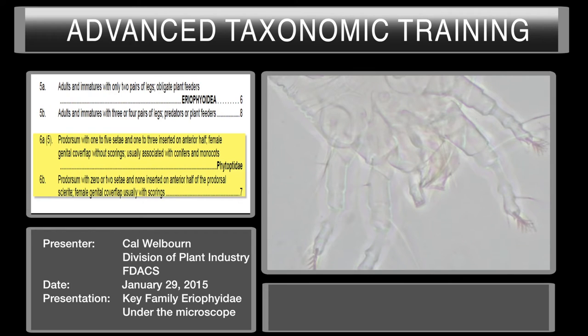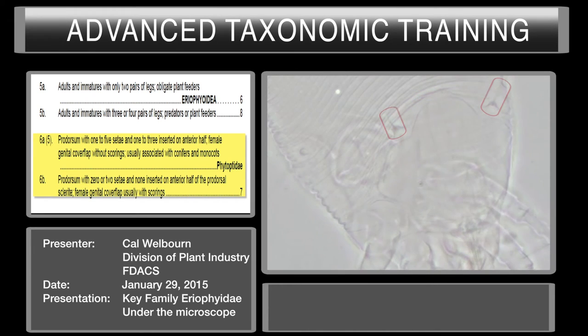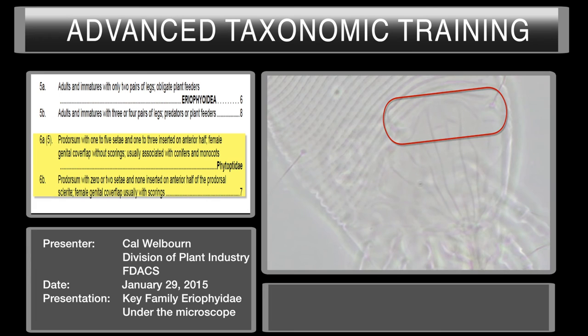That's couplet six. Prodorsum with one to five setae, one to three inserted on the anterior half of the prodorsum. Female genital covering without scorings, usually associated with conifers or monocots. In this case we'll assume we don't know the host. We'll look at the prodorsal sclerite first. This is your prodorsal sclerite — it has two pairs of setae, one here and one here. It can have one to five; we have two. But we need to check whether one to three are on the anterior half. This is the posterior part, this is the anterior. Both of these are on the posterior part. Focusing up and down, we see no other setae. So it has two pairs of setae and they're both on the posterior half.